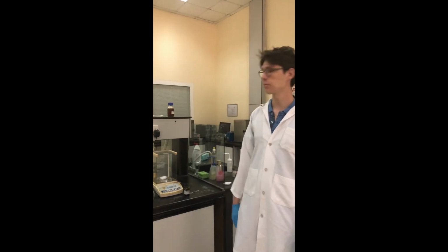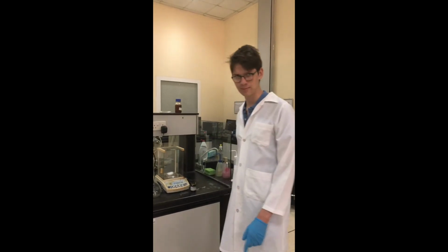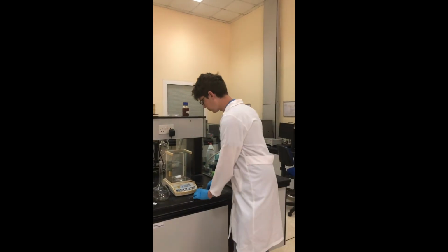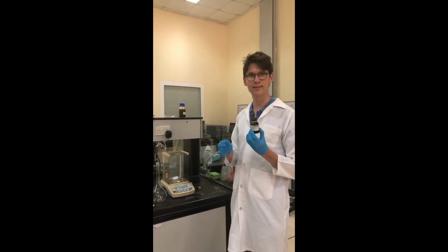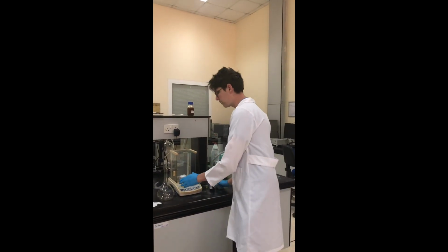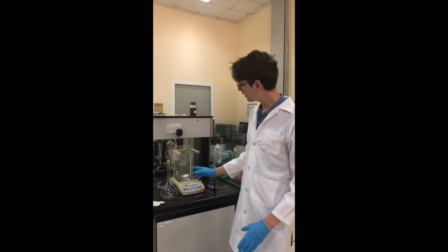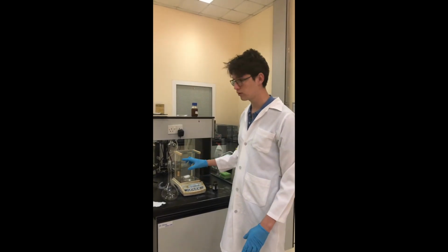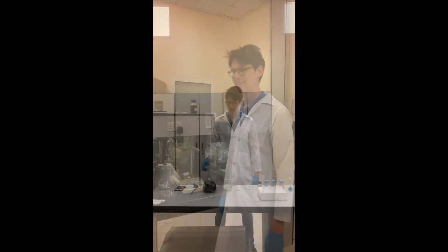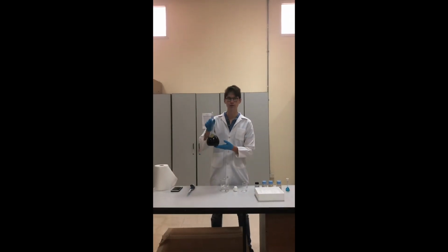Hello, I'm Amin, and I'm going to show you how to do the experiment. First, we're going to prepare the stock solution. For that, we weigh 99.8 milligrams of methylene blue dye. Then we add it into the flask, and then we fill it up with water until we reach a total volume of 1 liter. Okay, so now we've got the stock solution ready.